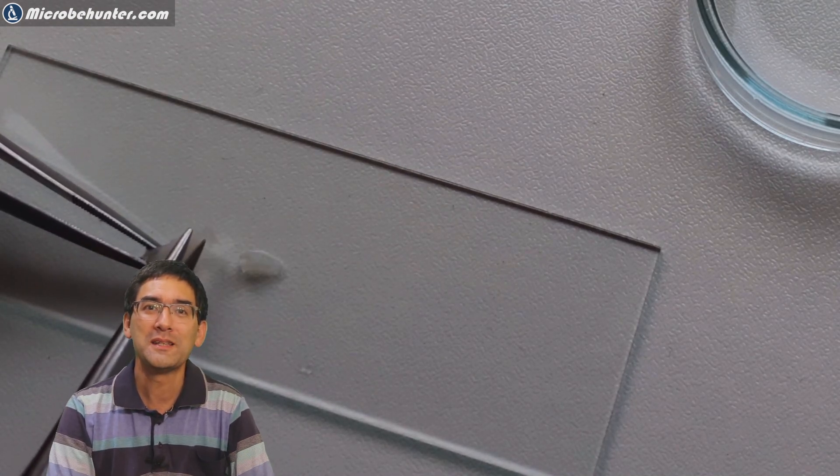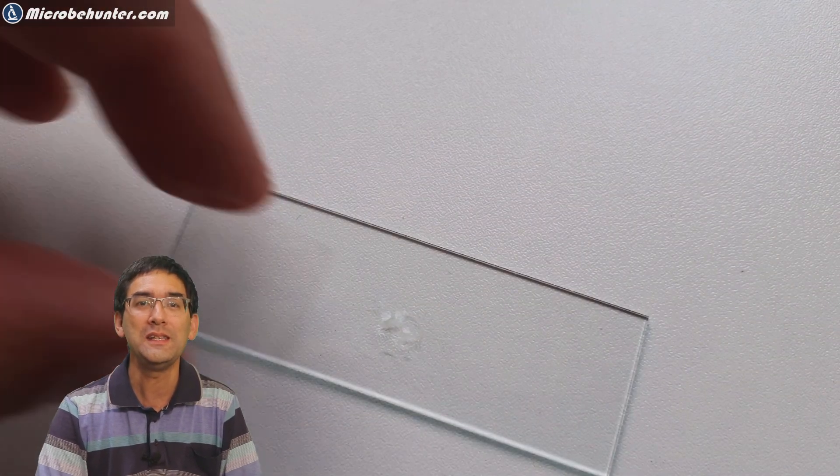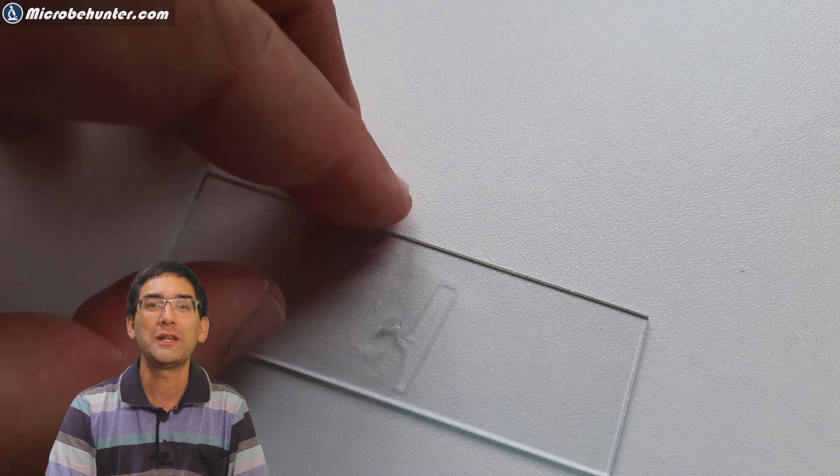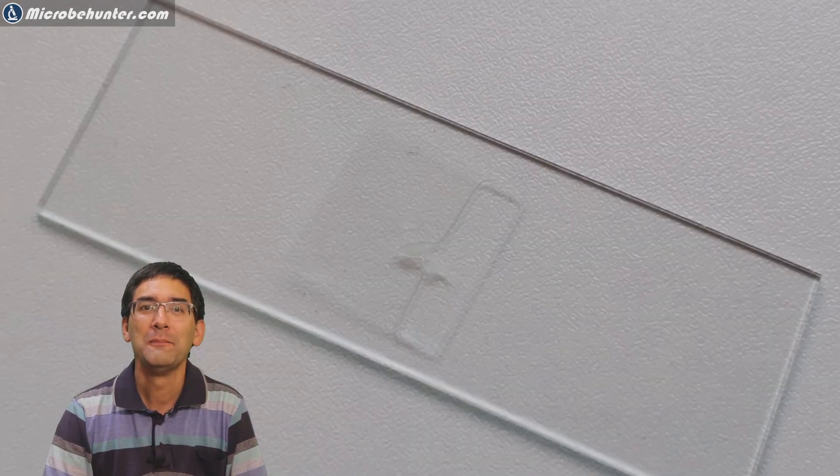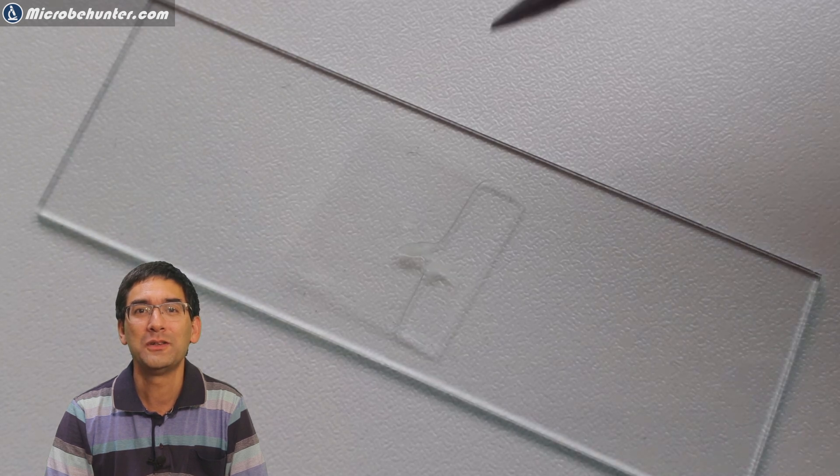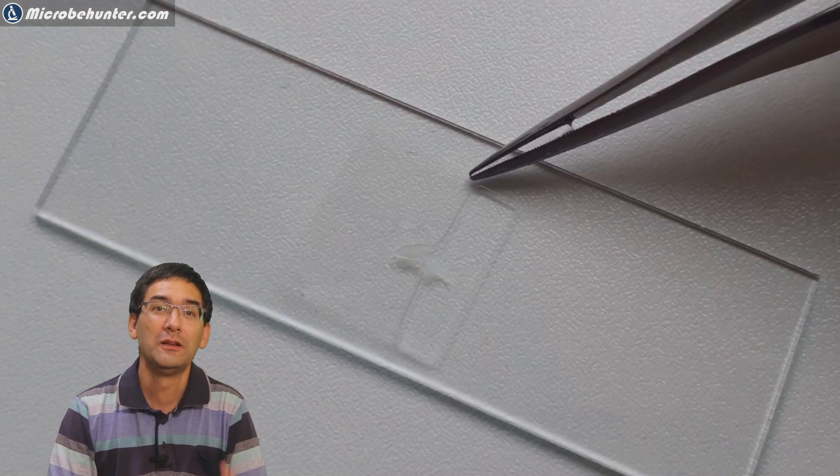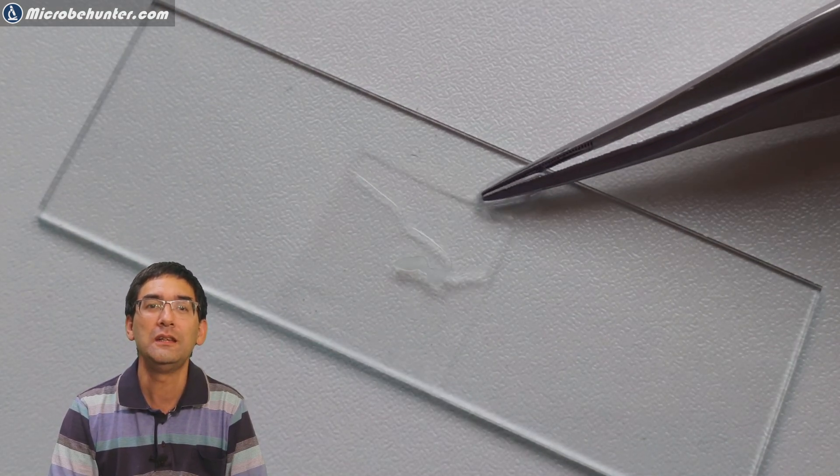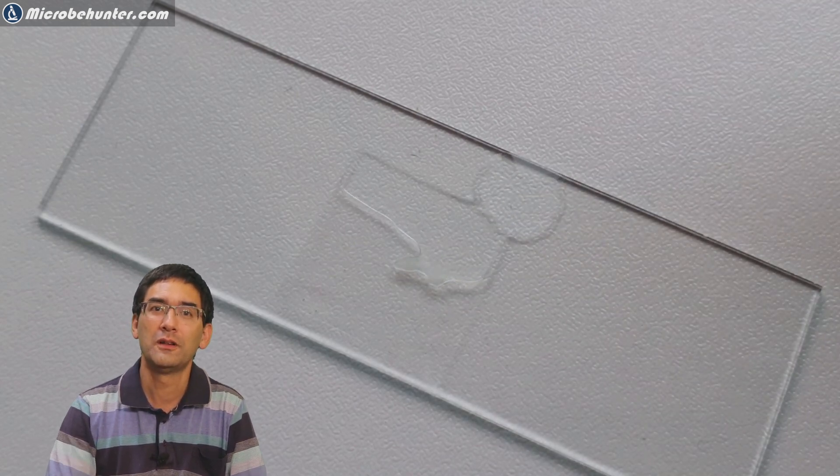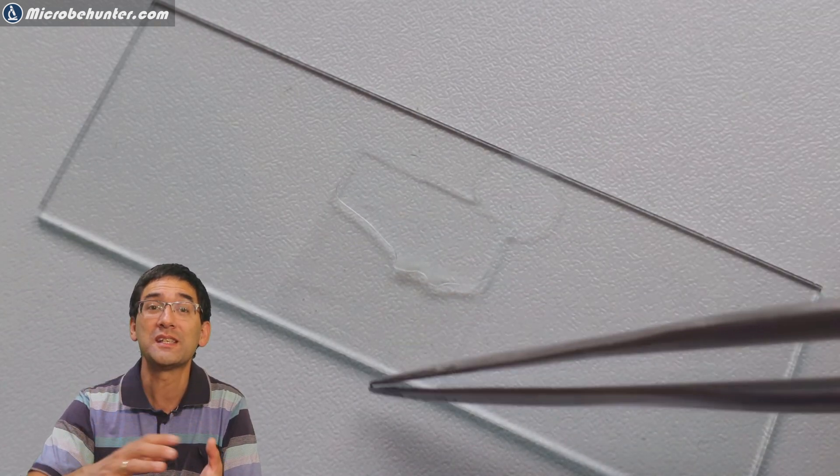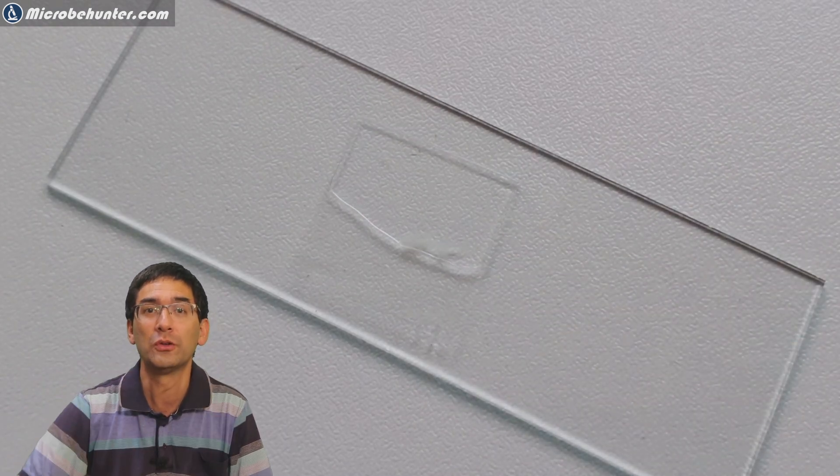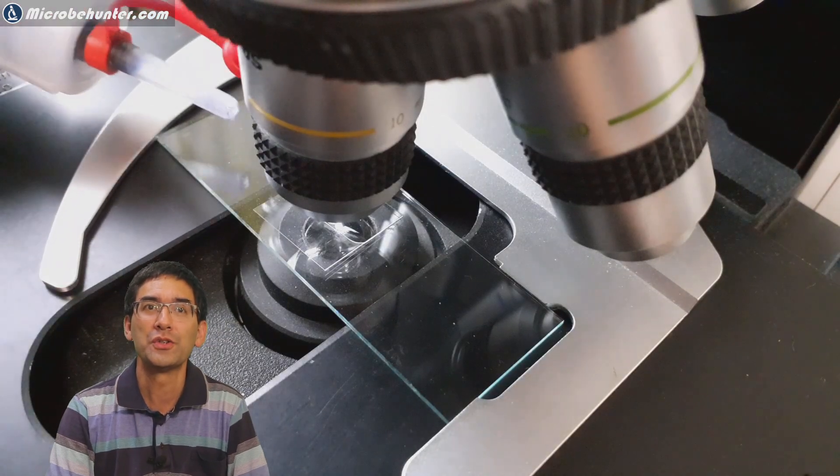I've already made several videos about onions because the onion skin can be observed quite easily. Unfortunately here I was not able to get the onion skin - I had to do a little bit of cutting. The little piece of onion itself was luckily small enough to see the individual cells. Often the structures are so big that you don't see the cells because they stack on top of each other and are too difficult to see.